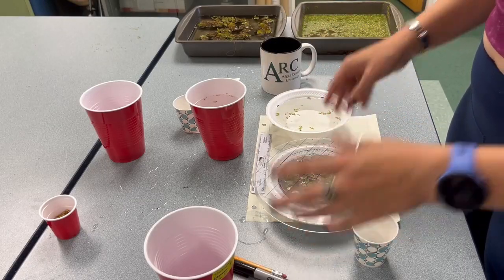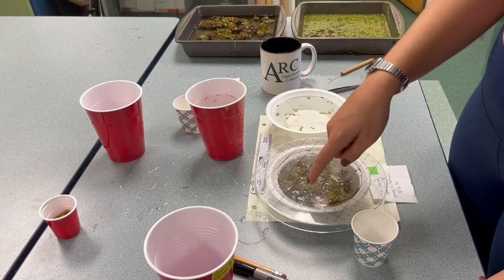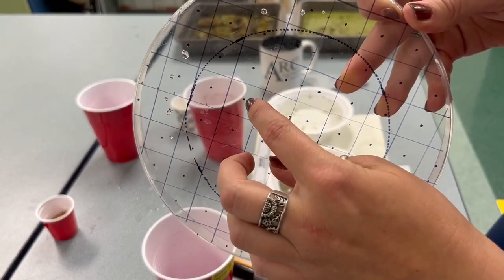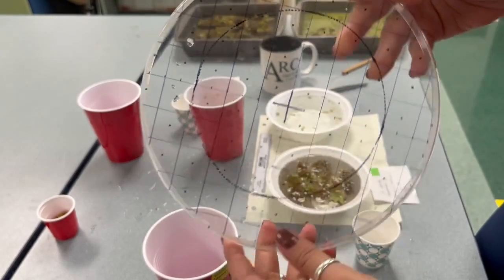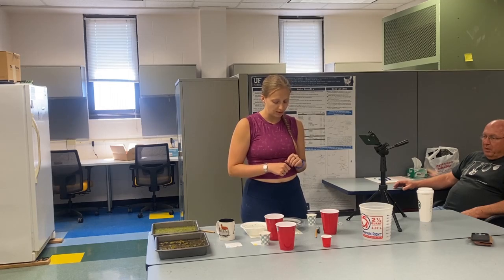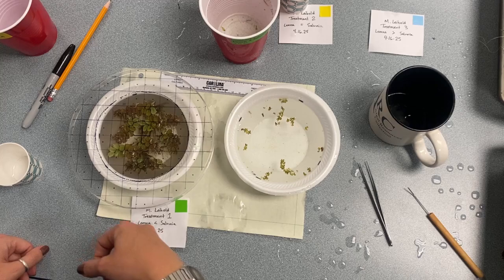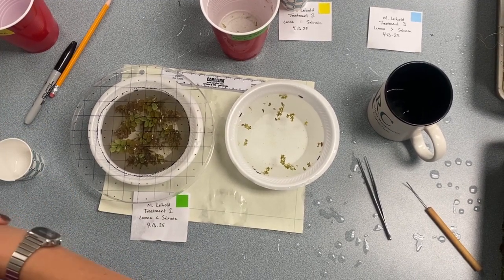And then what you do is you count the number of times that, as you're going across here, a leaf of either of your species intersects with either a dot, which is sort of in these centers here, or a vertex here. Okay. You'll just note the number of times that it intersects with one of those 2 points across your little surface area here, and then divide that number by 49. And then you will get the approximate area of coverage for your species.